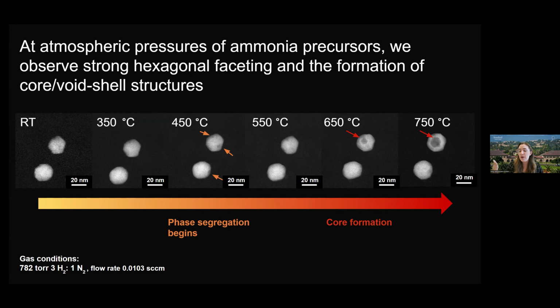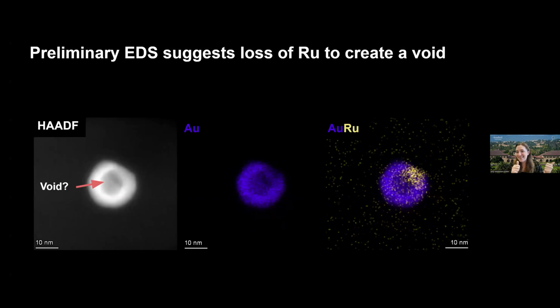So when we heat our particles in the presence of gas, we see some new and exciting things. First, we do see the same phase segregation, but it occurs at slightly lower temperatures. And then in terms of faceting, instead of a slight rounding that we normally see when heating in vacuum, we almost see a sharpening or a strengthening of the faceting, which is likely due to the gas altering surface energies.